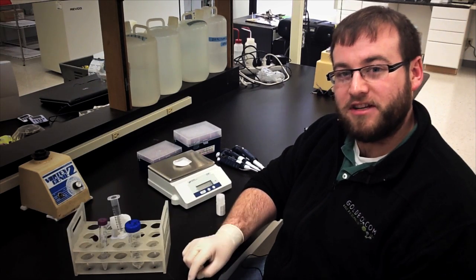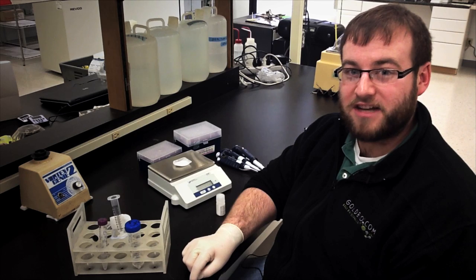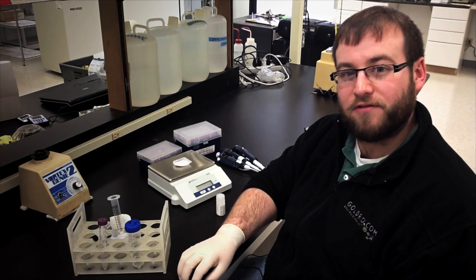Hi everybody, I'm Patrick from GoldBio and today we're going to go over how to make a one molar stock solution of IPTG and the best way to store that stock solution to maximize its shelf life.